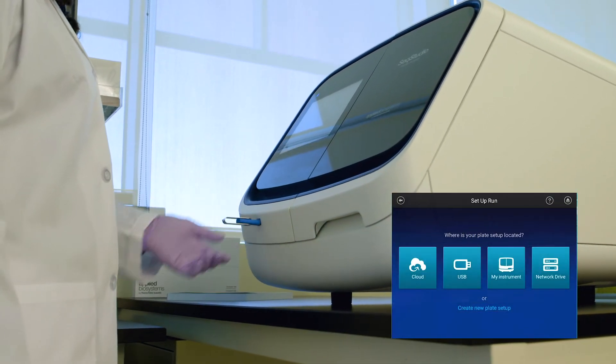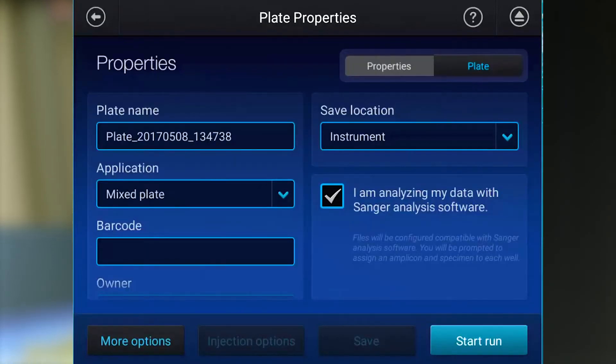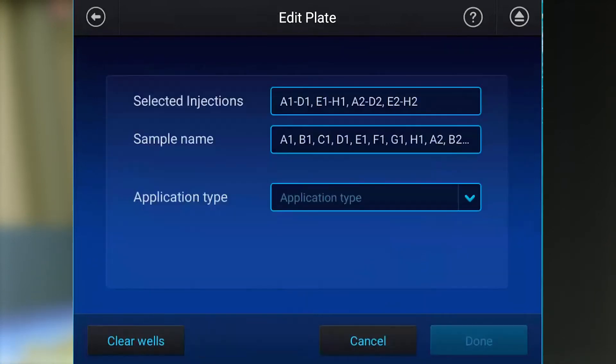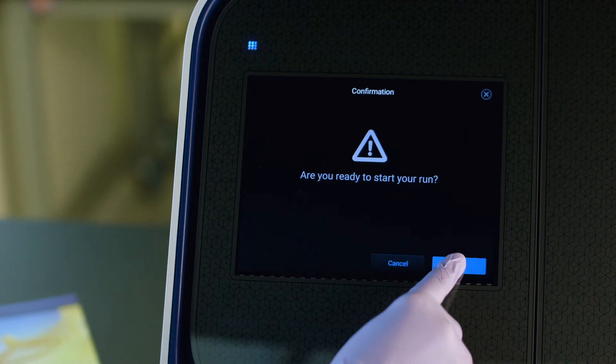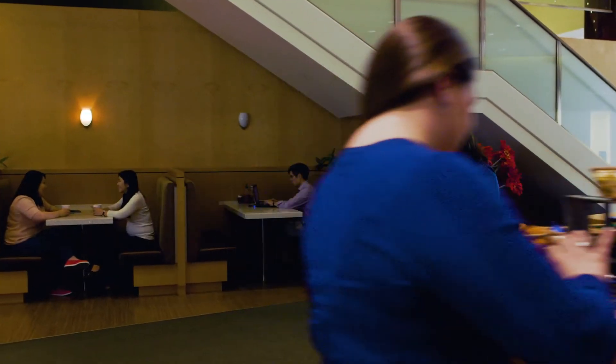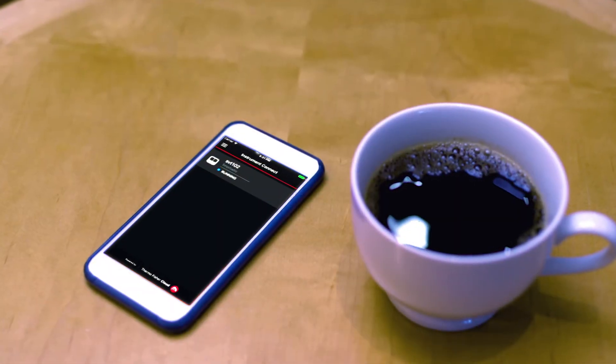You can set up your run remotely or right on the instrument. You can run both Sanger sequencing and fragment analysis samples on the same plate at the same time. Let's run. Check your run while you get started on another experiment or take a break.